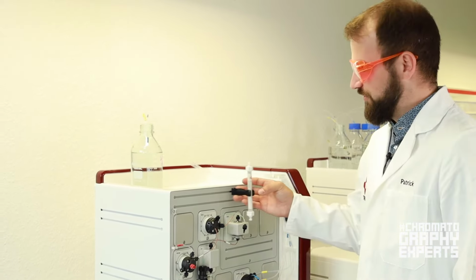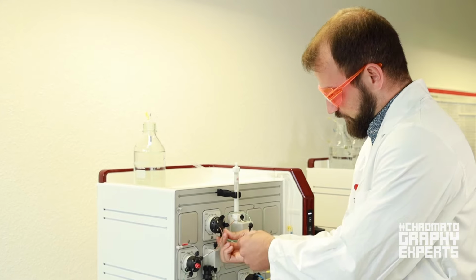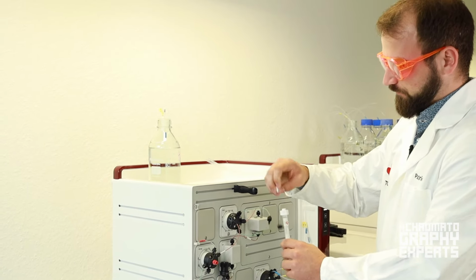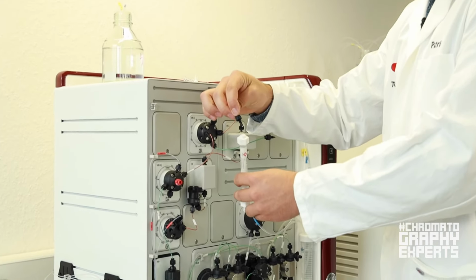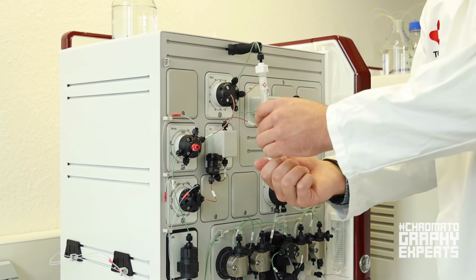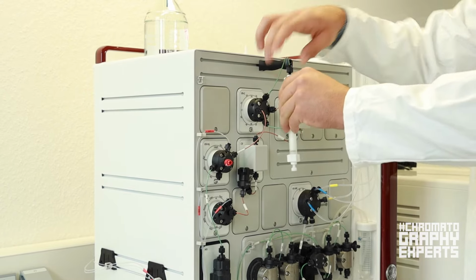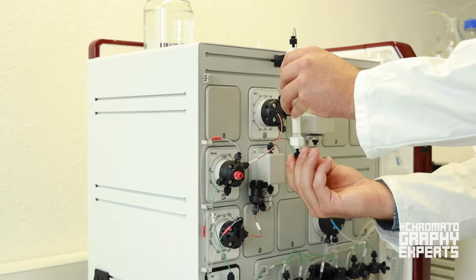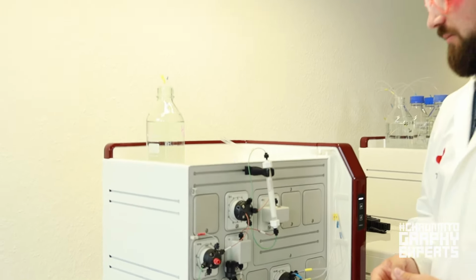Now I'm also going to show you how to attach the 5 milliliter column. Therefore, we first need a second tubing. Okay, and then we also start by removing the top plug and attach the top tubing. Therefore, I usually apply a slow flow rate to make sure I don't trap any air in the column. And then I just screw it for 2 to 3 turns, then loosen the bottom stop plug, then completely tighten it on the top end, remove the bottom plug, then connect it to the LC. And the column is ready to be used for gradient and method development.